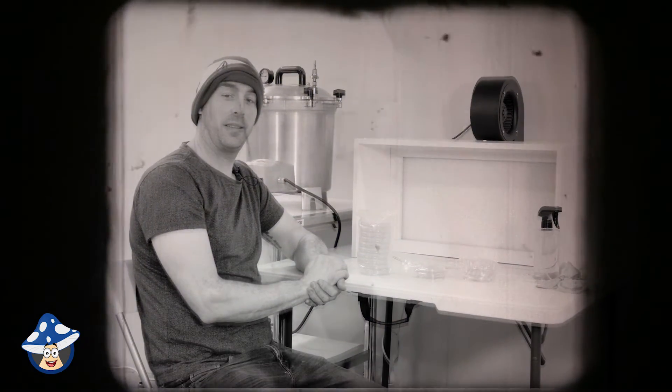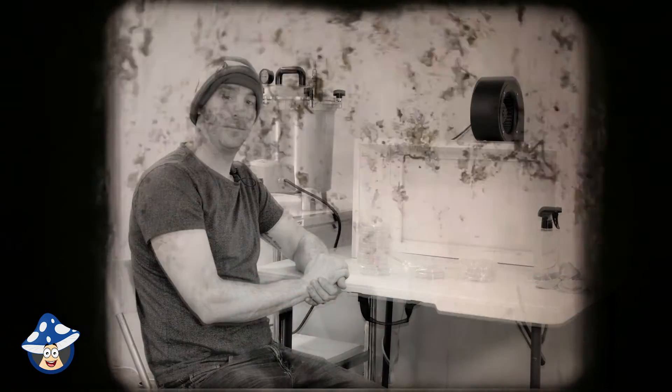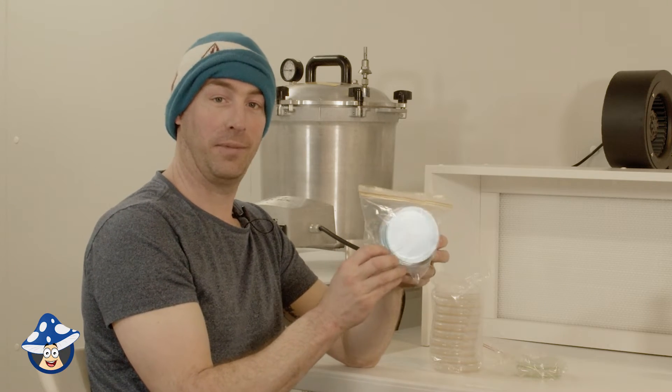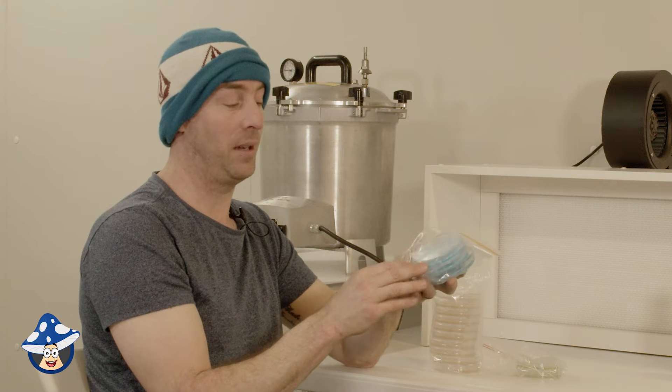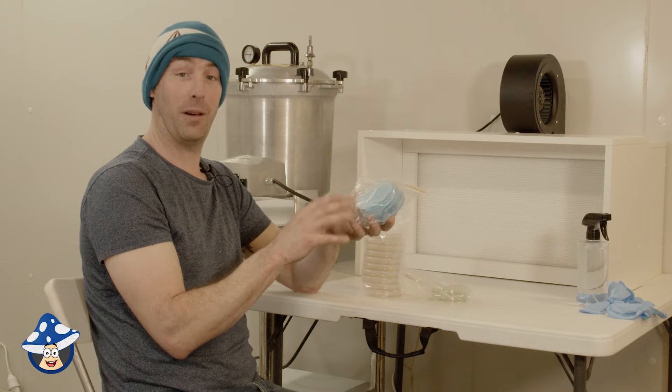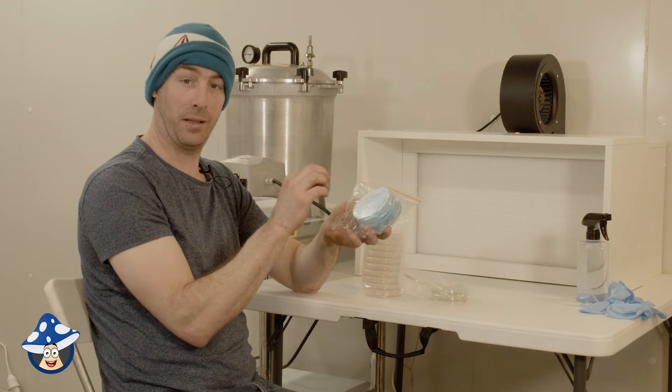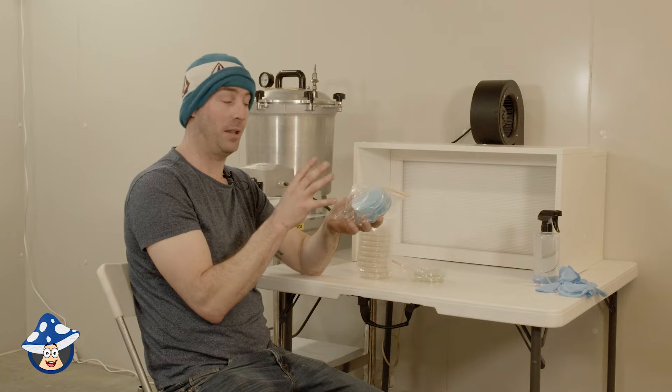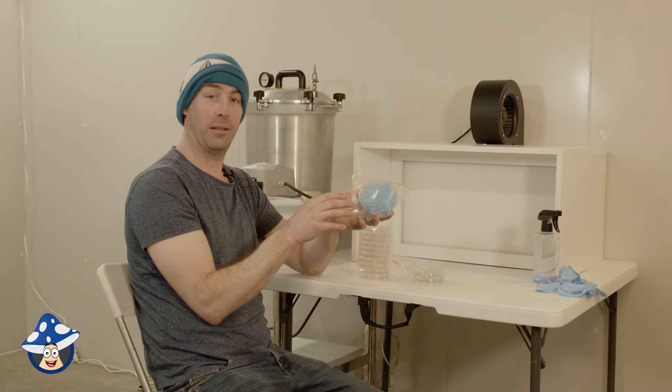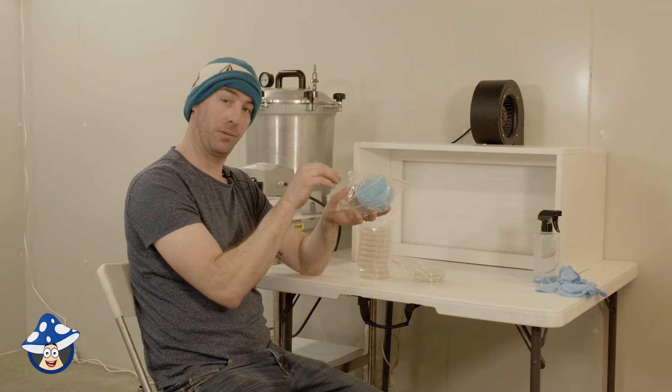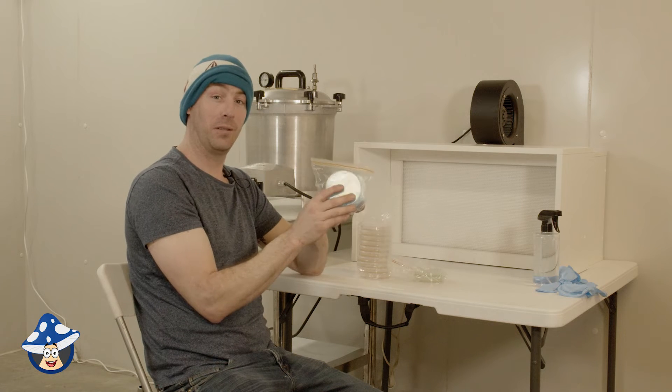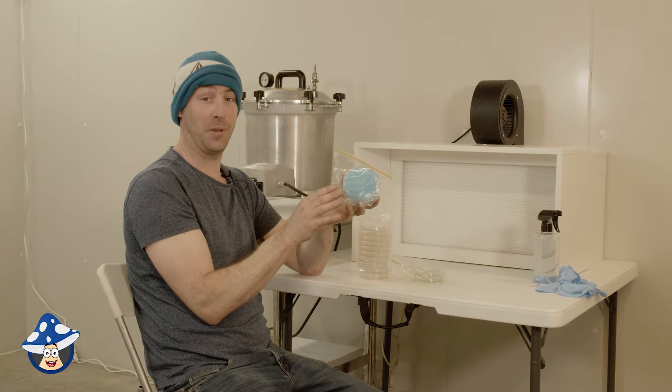Now let's do a quick in-between video. One of the most common questions we get asked is, what is agar good for? Or what's the different colors? Which should I use? Blue agar is just agar and water. That's it. So we do blue, so we know it's just water agar. It's good for cloning wild mushrooms. As there's no nutrients in the agar, things are very, very slow to grow. So if you take a little cutting from your mushrooms, the mushrooms have to grow under its own steam. So if you have any other contaminated spores and things or other bits landing on there, it really struggles to grow. So generally, although it takes a long time to grow, your mushroom fungus will get growing and then you can just cut the leading edge and go on to normal agar. So it's really good for cloning. And that's about it.